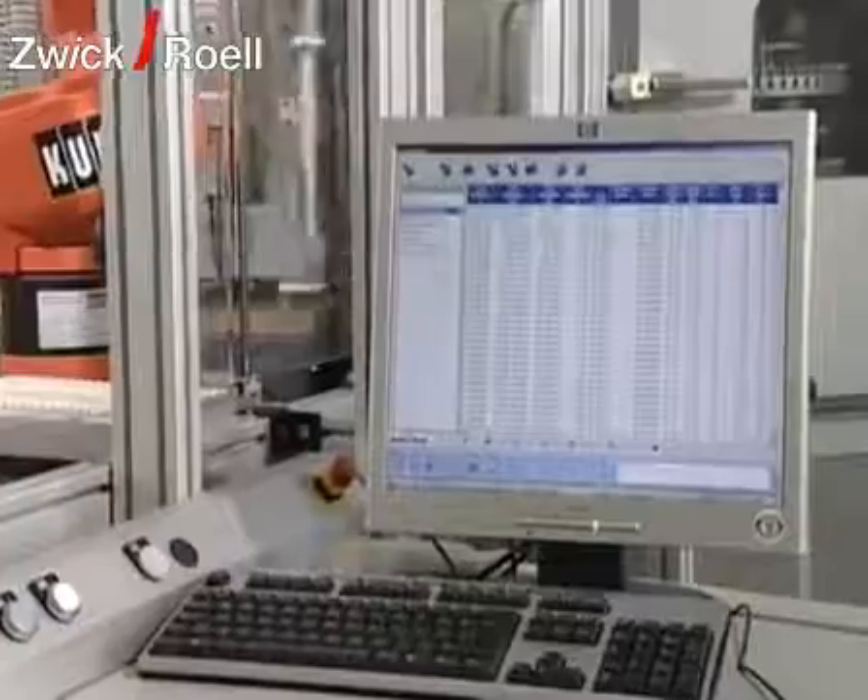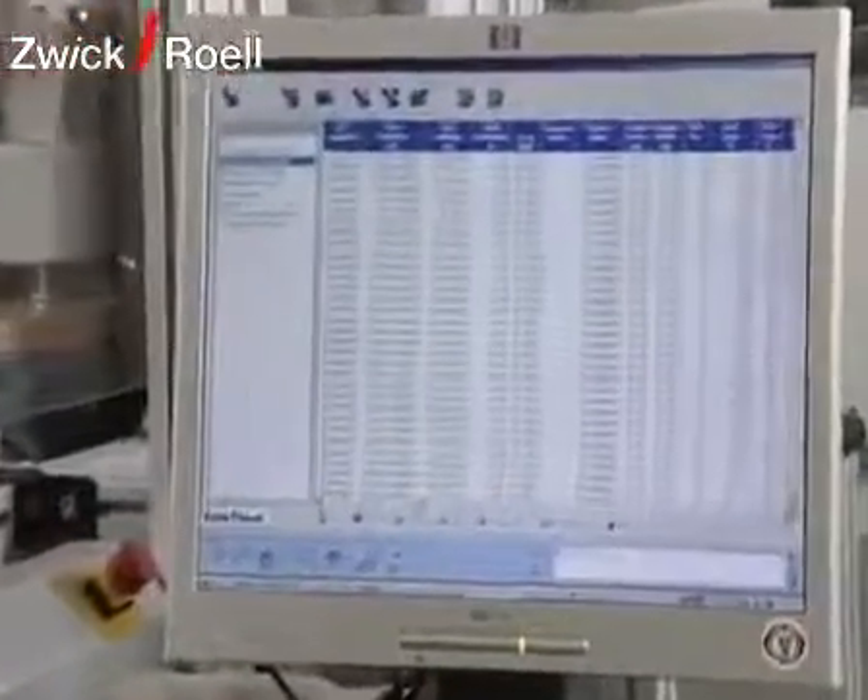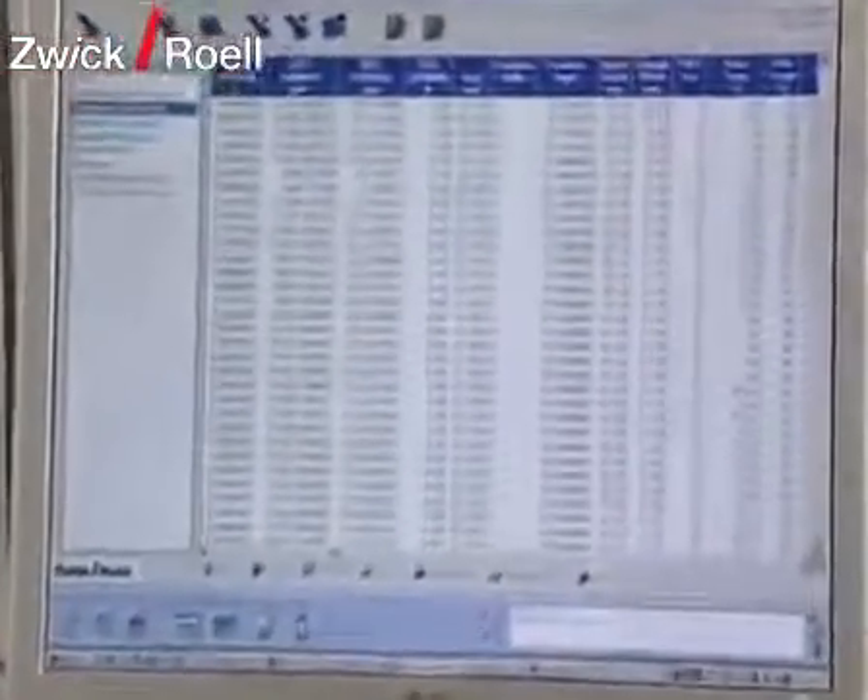After testing, what remains of the specimen is disposed of with pressurized air. For control purposes, the monitor shows which specimens are in the temperature chamber together with their test requirements and the results.